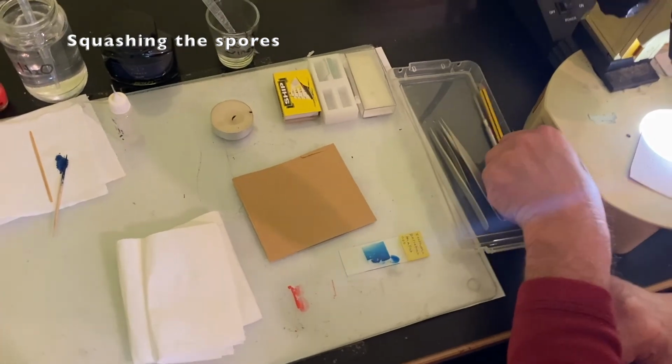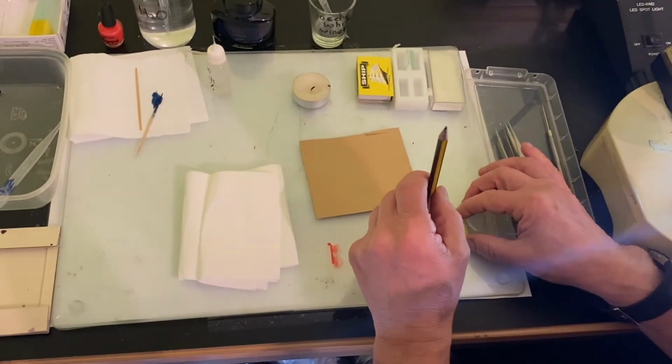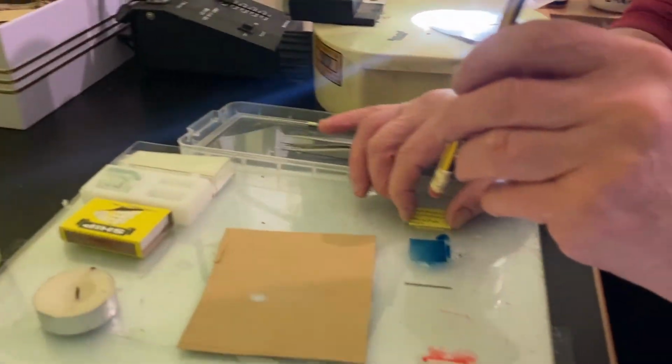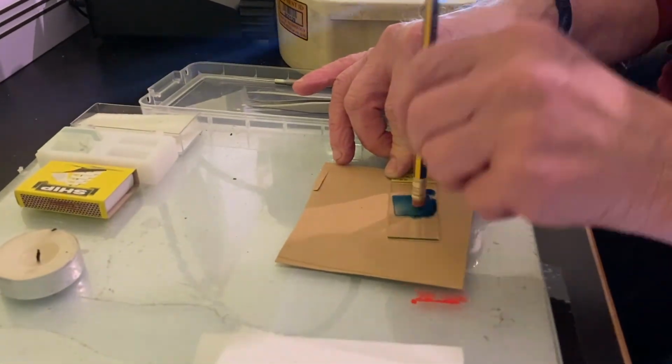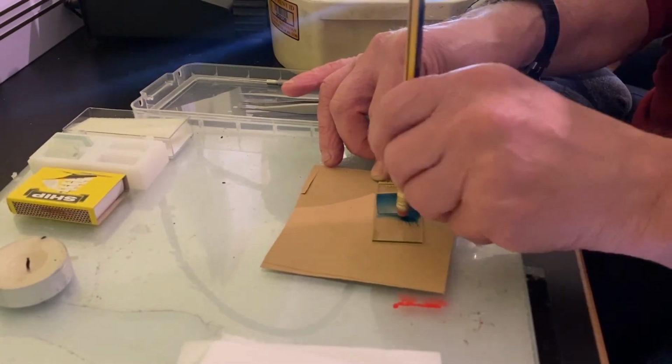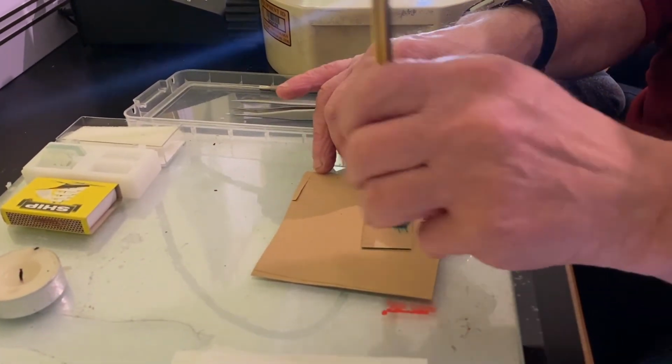Squashing the spores from the apothecia. Using the rubber end of the pencil, tap this vigorously on the cover slip with the slide supported on a firm surface to obtain good separation of spores from the apothecia.